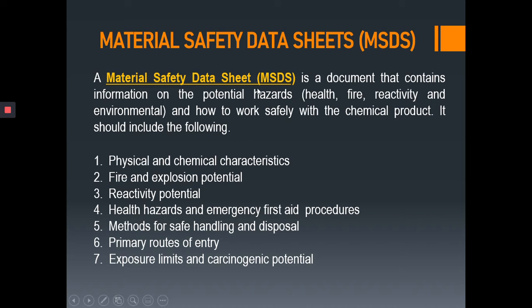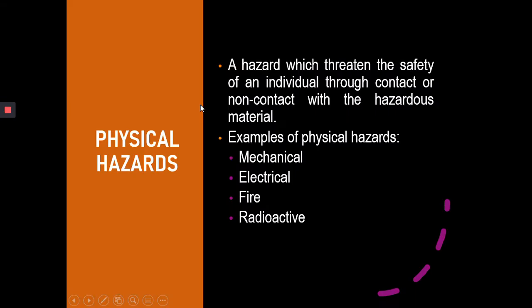So all this information seen in your MSDS will help you handle the chemical very well, especially if there are accidents inside the laboratory due to that chemical, or when you're exposed to that certain chemical. At least you know how to handle the situation because you have a guide through the material safety data sheet.